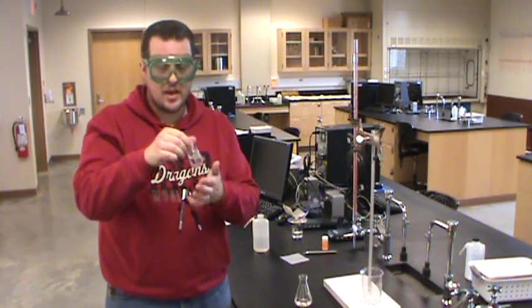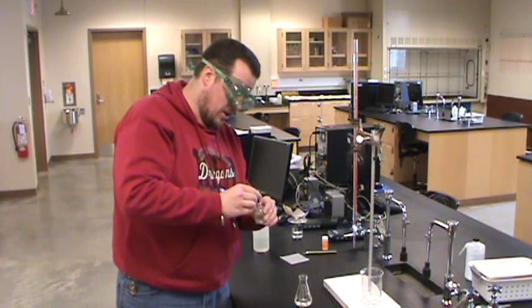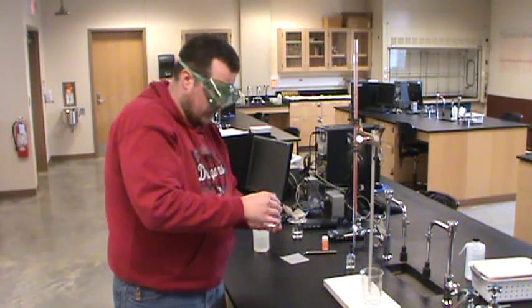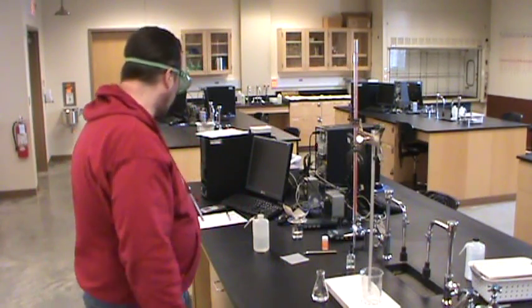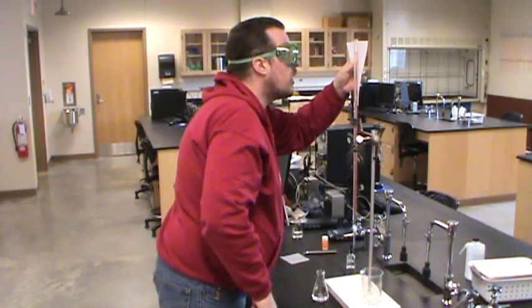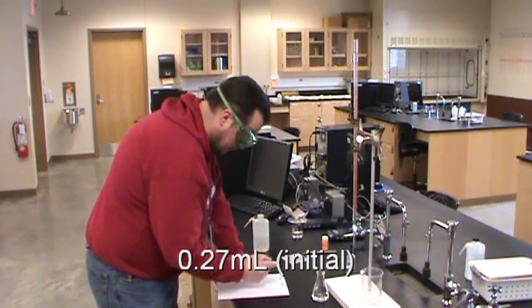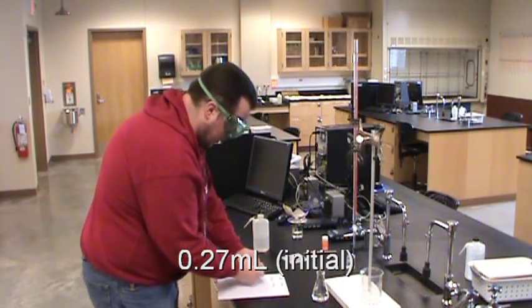Most important step, don't forget to add the indicator. Phenolphthalein indicator is colorless in acidic solution, so even when I add a few drops of indicator, it's not going to change the color of the solution yet. So my indicator is in, my burette is loaded and ready to go. Now all I need to do is take the initial burette reading. Looks like it is 0.27 milliliters. So my initial is 0.27 milliliters.